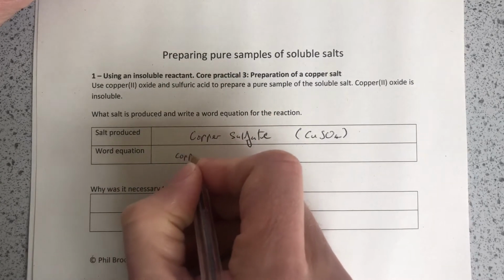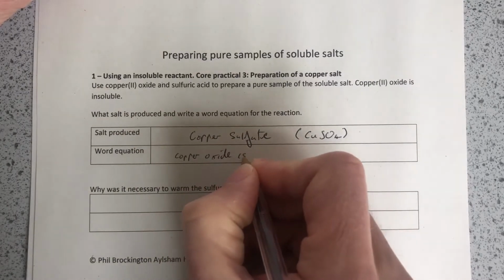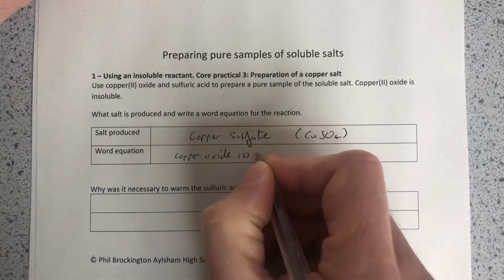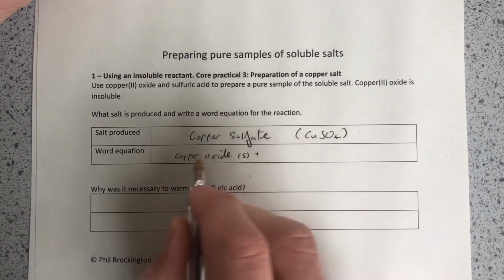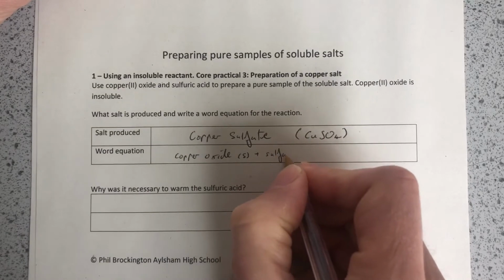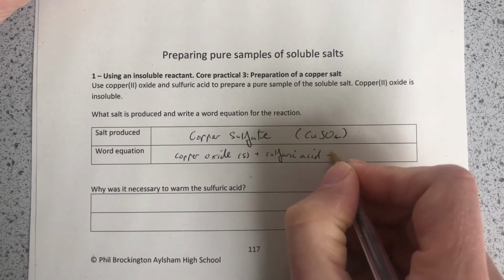So the copper oxide is what we're going to start with, one of our reactants, and that is a solid. It will not dissolve in water, and that's important. We're going to do a neutralization reaction. We're going to neutralize sulfuric acid. So we're going to react sulfuric acid with the copper oxide, and that's going to produce the copper sulfate.